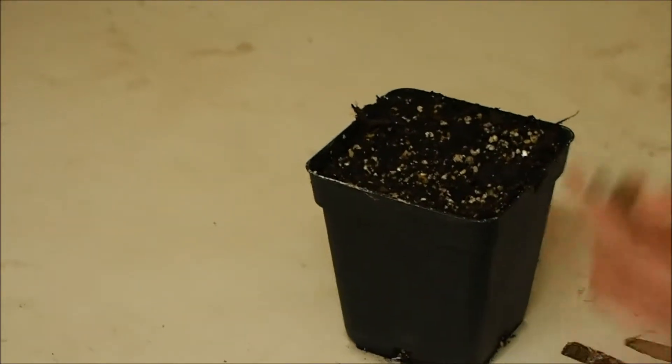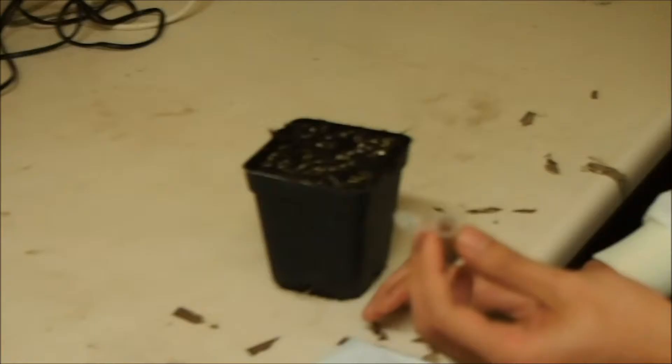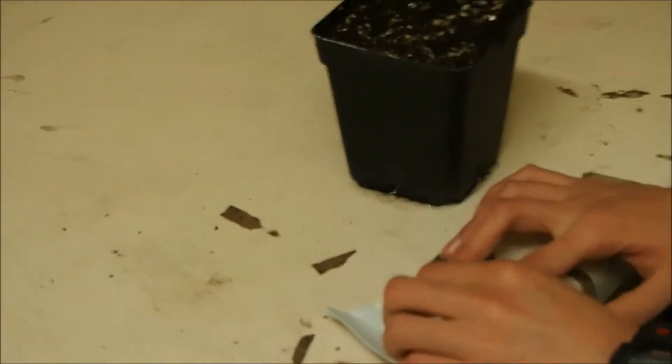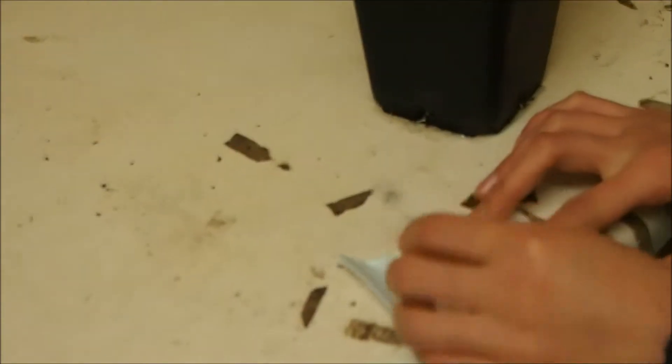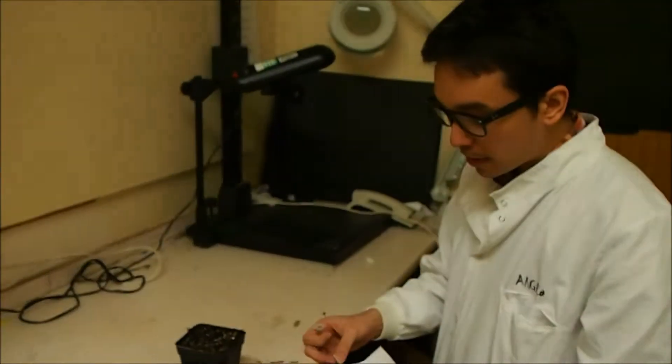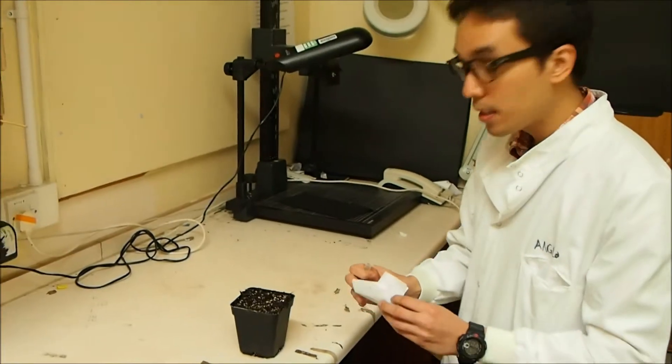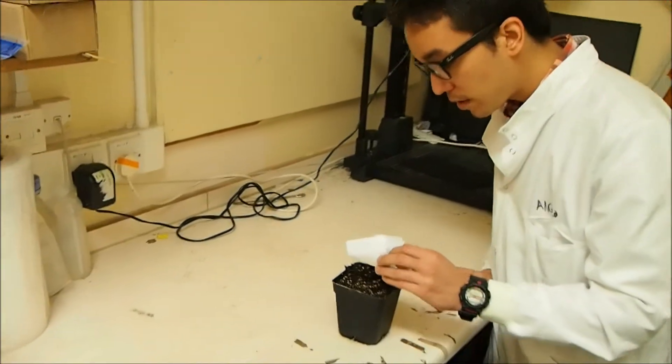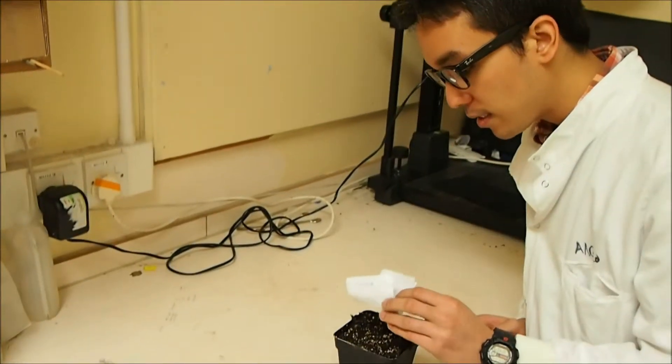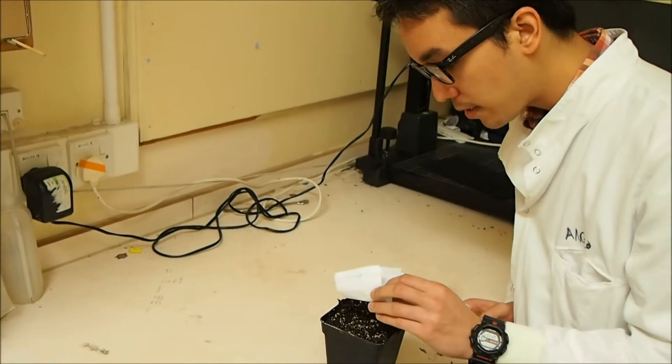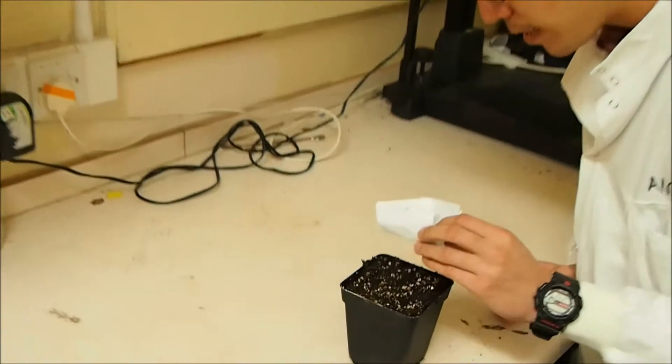And these are the seeds that I'm going to be using. When we put it in the paper, you can actually see the actual size of the Arabidopsis seeds. It's quite tiny. Now I'm going to take a portion of the Arabidopsis seeds and sprinkle them over the pot just slightly so that you can get an even distribution. Just slowly, slowly.